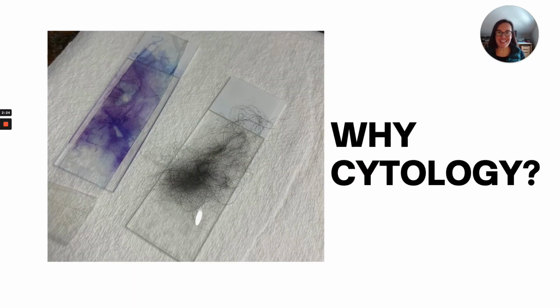So why cytology? These are slides that one of the interns at Angel West collected. These are tape preps that, God love her, she stained. I don't know what she was thinking of evaluating with this clump of hair, but really this dog had a pyoderma, and she was doing her best to collect cytology. I saw these in our little microscope area, which is usually used by me and the interns, and I went right to her and said, listen, Coley, you need some help. I'm going to help you with your slides.